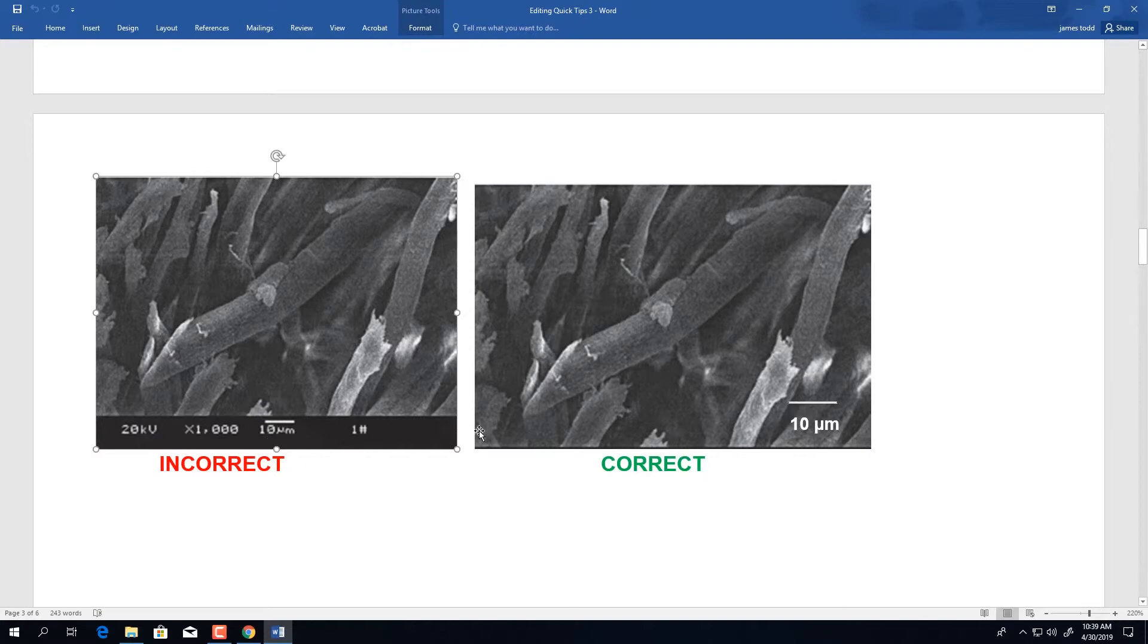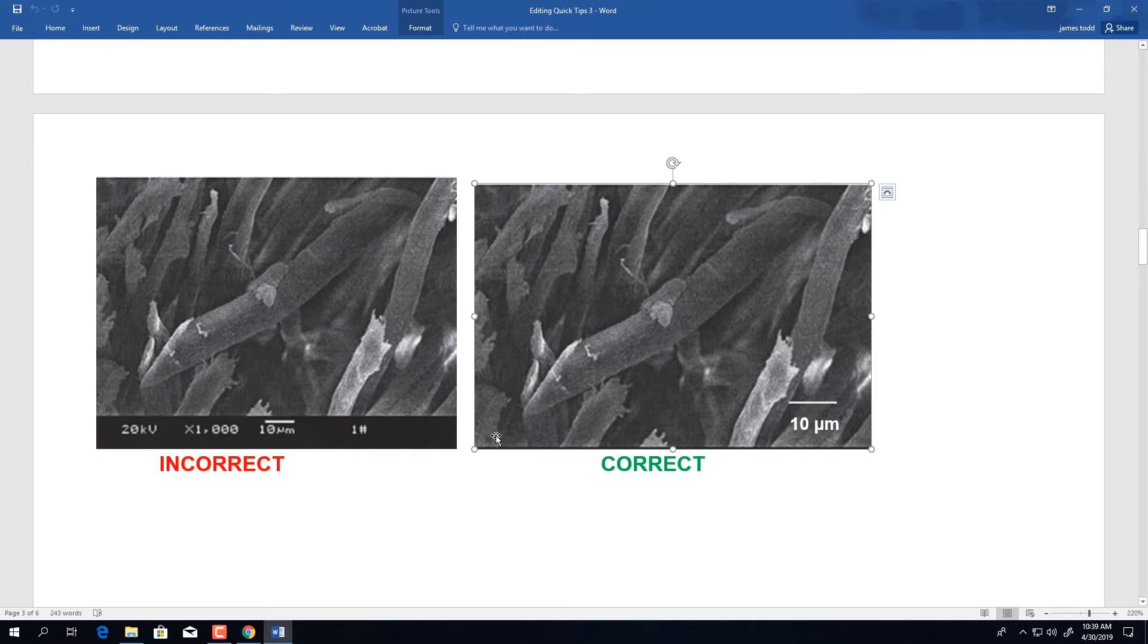When submitting to the journal, please be sure to crop this information from the bottom of the image and insert an appropriate scale bar in the lower right hand corner.